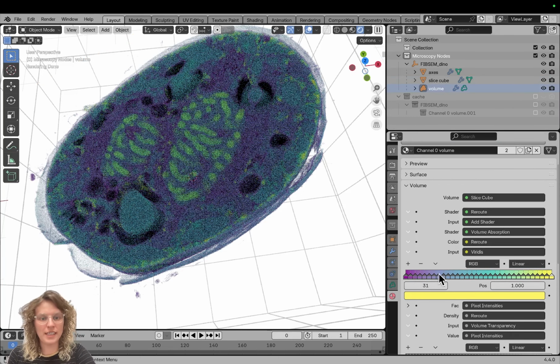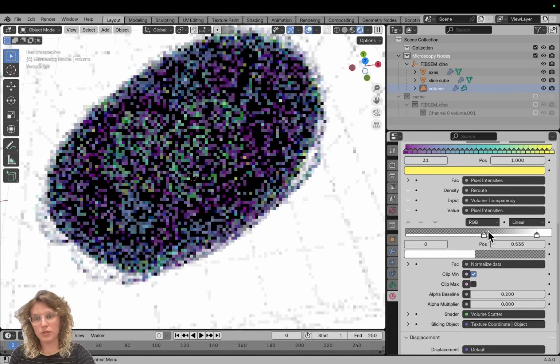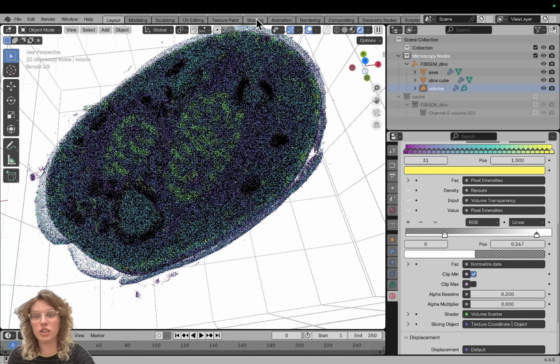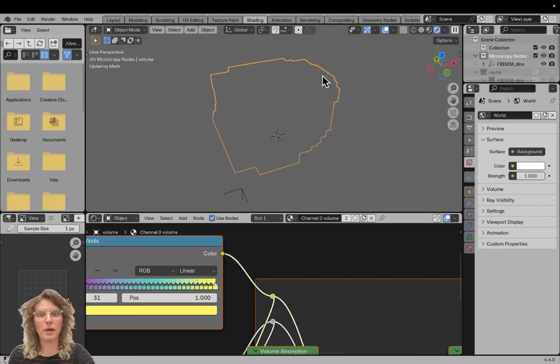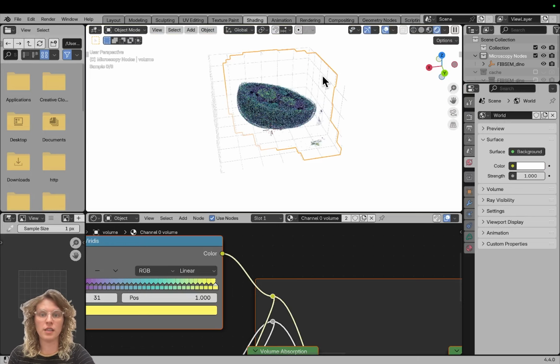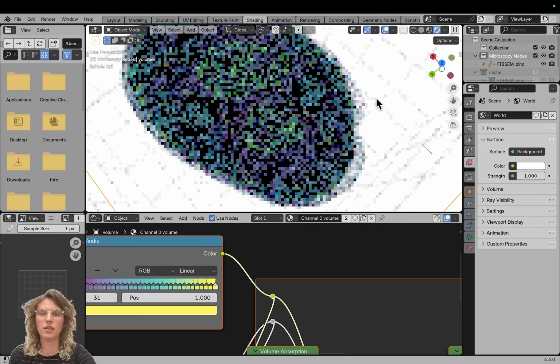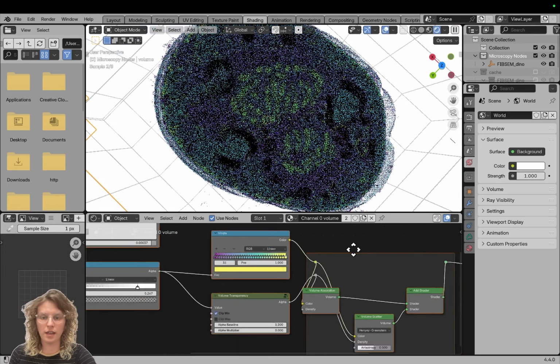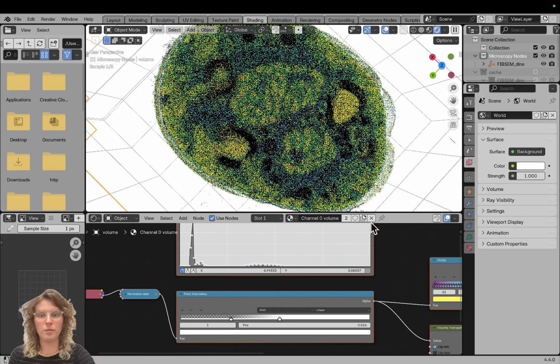where we can first see here our lookup table for the colors, and here we have our pixel intensities. And that is more easily seen in the shading tab, which is here. And we need to go back to a ray traced version. And that is here. So here we have also our histogram, and we can see our pixel intensities.